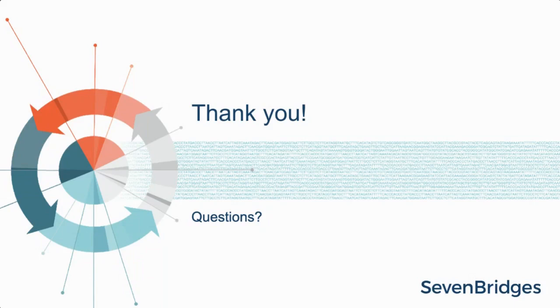Did you use the latest version of Monocle? And are there other versions you should consider? So at the time when we were doing this analysis, Monocle 3 was in alpha version, so we used Monocle 2. After that I tried out Monocle 3, but it doesn't provide some of the options that we presented today.